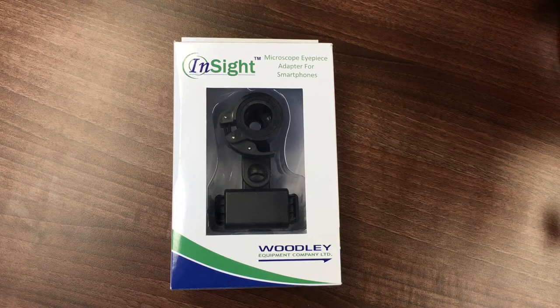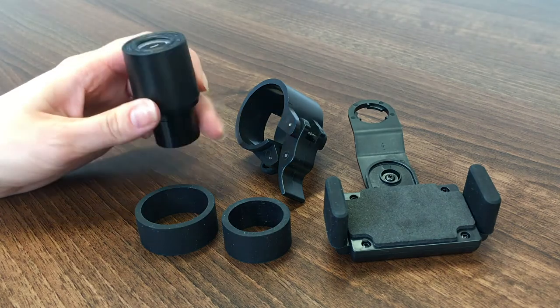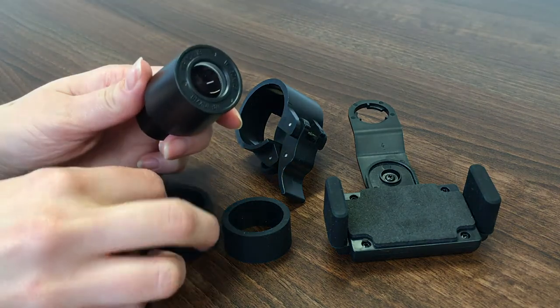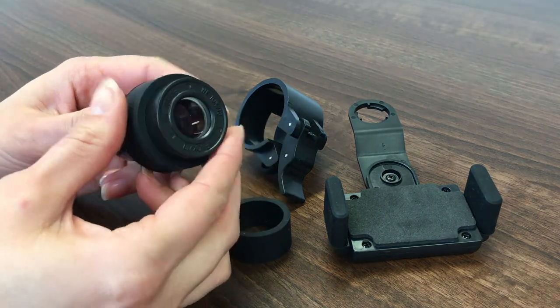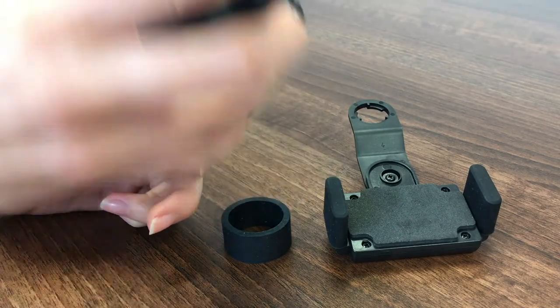It allows the attachment of a smartphone to the microscope's eyepiece so that a smartphone camera can be used to capture images and video down the microscope, as well as enabling real-time viewing. To use the microscope adapter, first remove any eyepiece cups which may be present and use the rubber bands provided to ensure a tight fit. It is usually best to place the bands halfway down the eyepiece as shown.